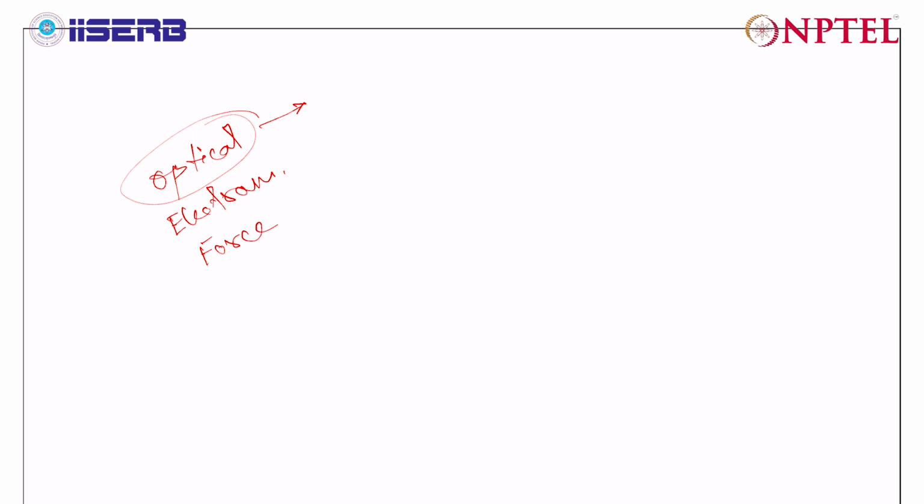We can't go below a certain resolution, and hence electron microscopy is needed if you really want to image very small feature sizes, say in the range of nanometers. Then it's better you take help of electron microscopy, where electron beams are used in order to image a surface.